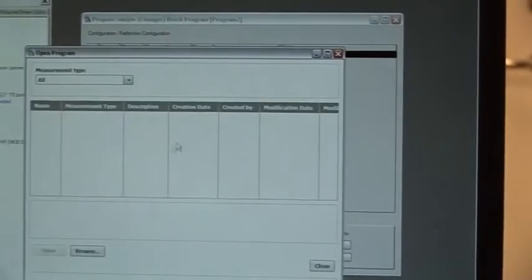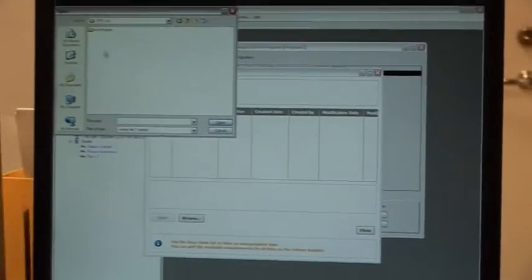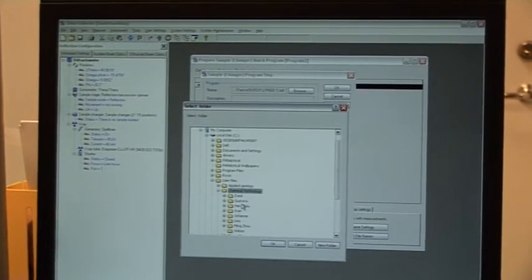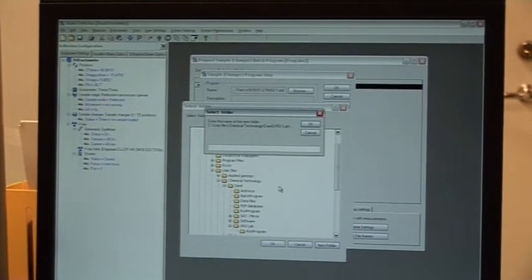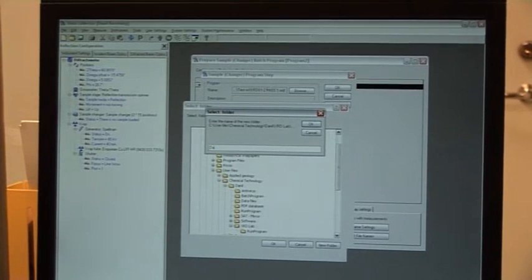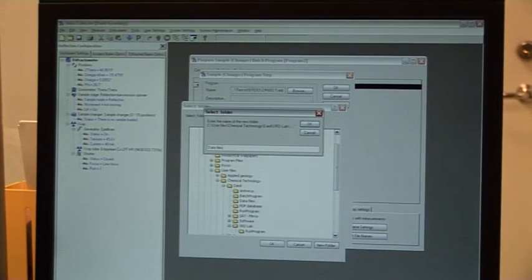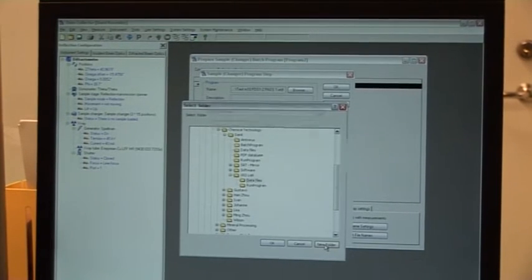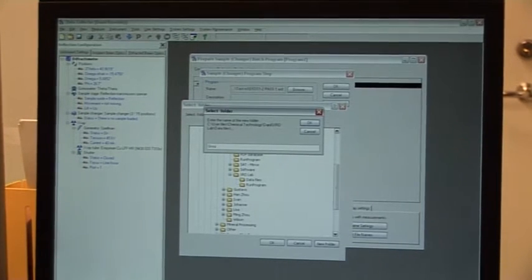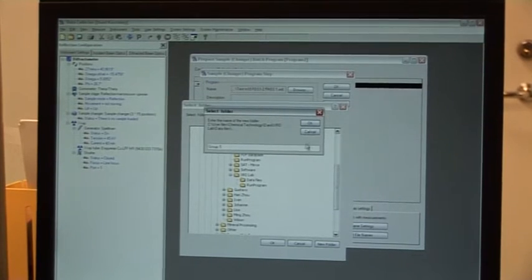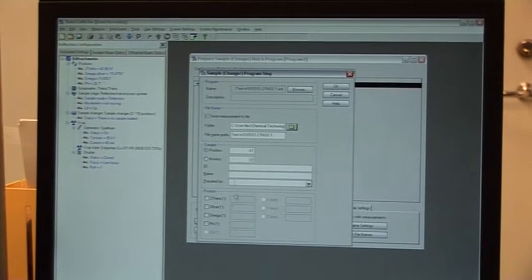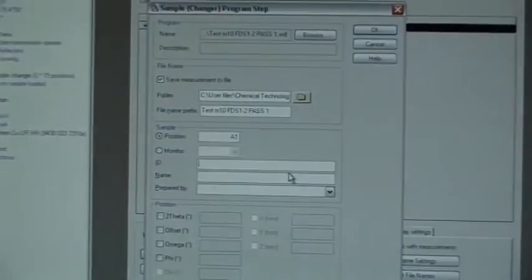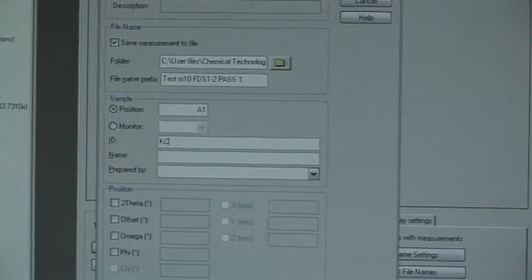So we just go to Insert. Basically we pick our program and then we pick a folder where we want to save the data. Here we write, we can see that it's calling for position A1. And then we write the sample ID, it's basically the sample name. For instance, first one was potassium chloride.